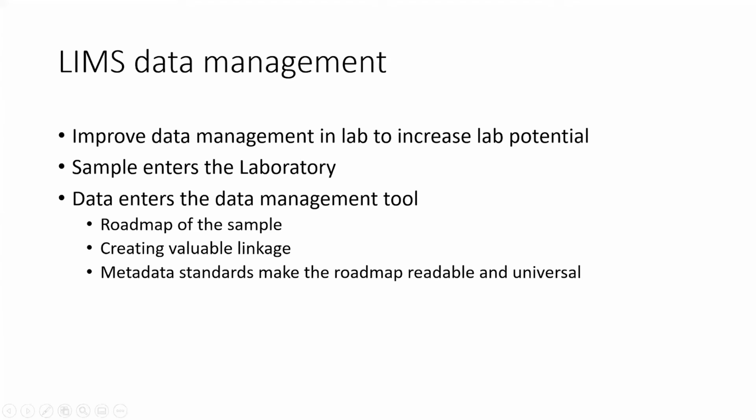The associated metadata, so data of that data, enters the LIMS. The LIMS effectively draws the roadmap for the sample lifecycle, and this creates a valuable linkage between the sample and its associated data. Therefore, standardizing the data makes the roadmap readable in a universal way, and harmonization is incredibly beneficial to interoperability.